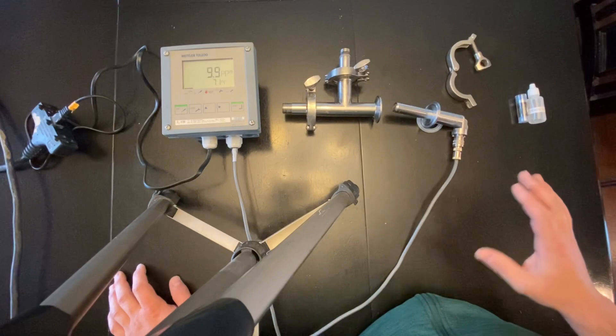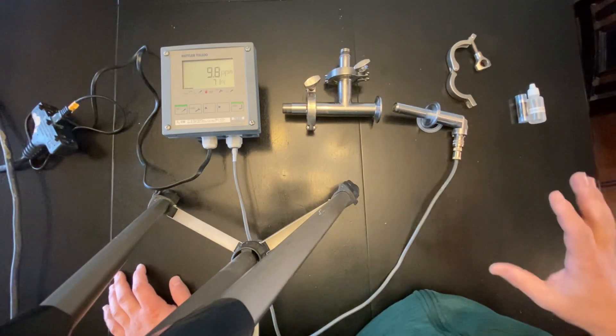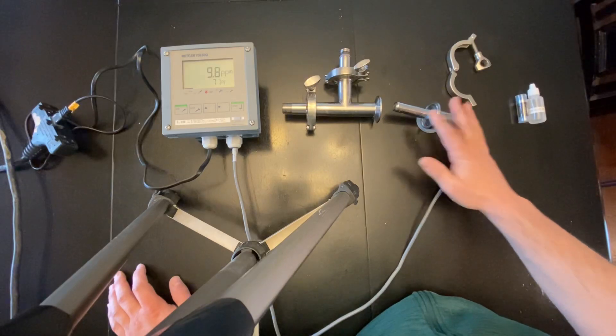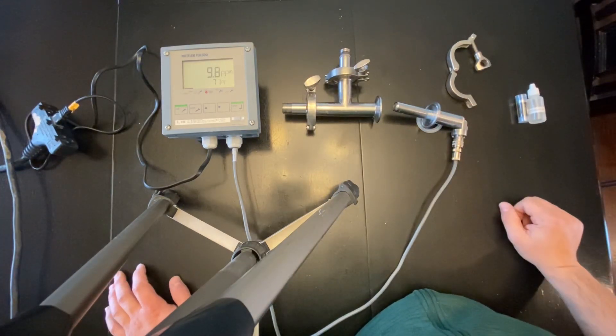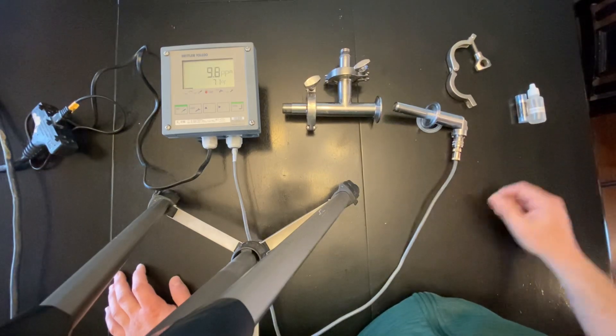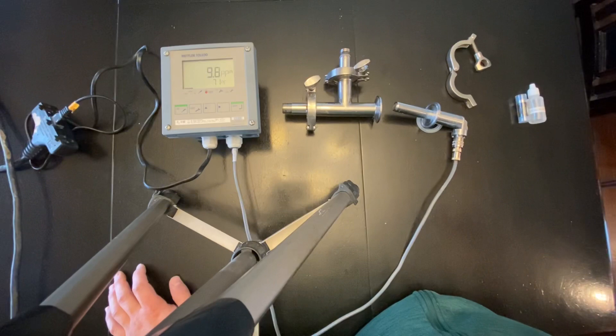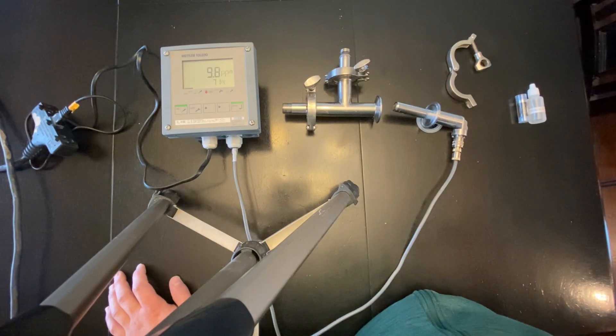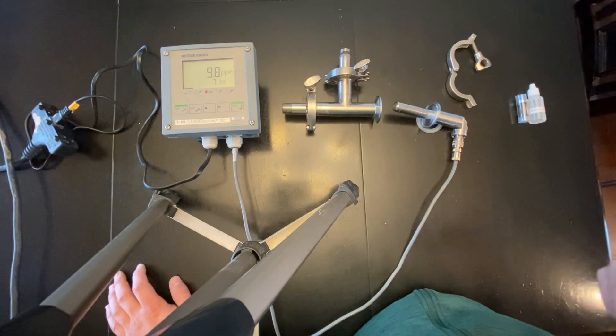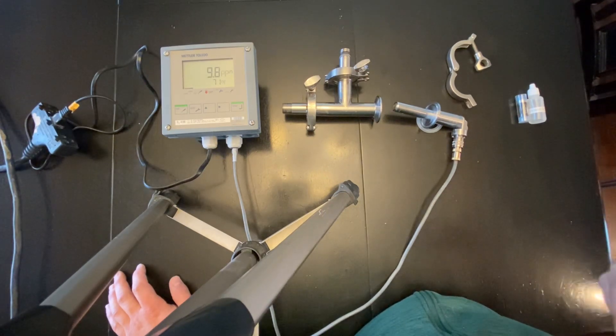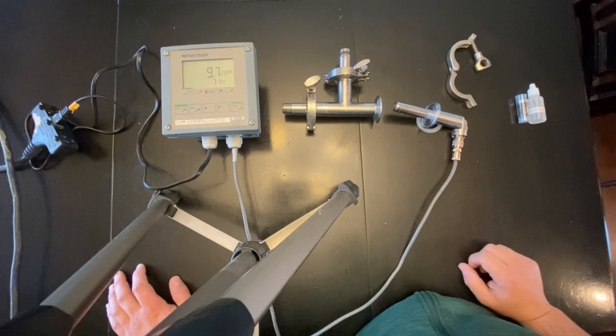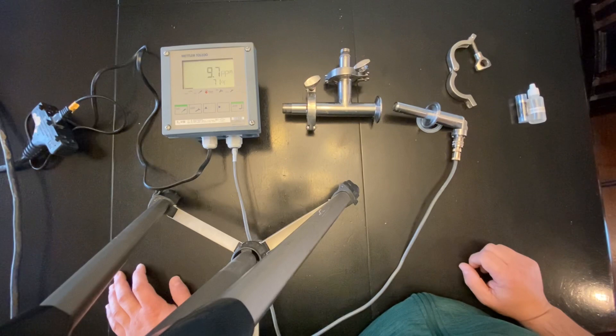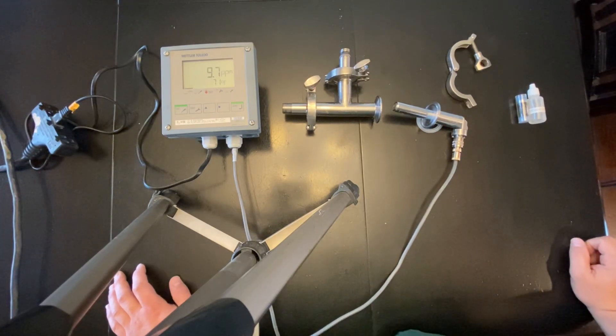As far as the overview of the in-process DO meter, like I said, sanitary fitting, it can go anywhere, it can be subjected to any temps. You can really use it to get a feel for your system and your processes under letting deoxygenation, boiling, how much oxygen you're left with after the boil, which means your sulfites have been consumed, which means you may want to up your sulfite dose.